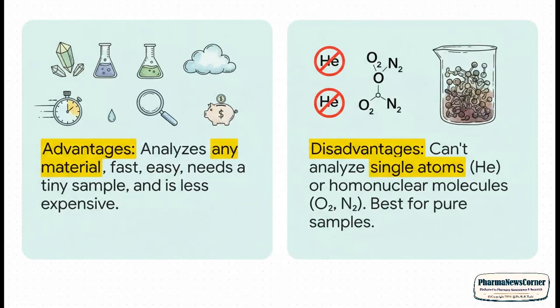Of course, like any technique, it's not perfect. The advantages are huge, for sure. You can analyze solids, liquids, or gases. It's super fast and pretty easy to do. You only need a teeny tiny amount of your sample, and the instruments aren't crazy expensive.